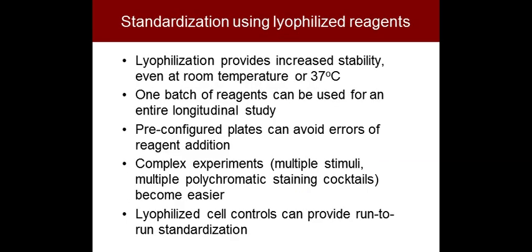Let's go on to the point about standardization, which goes kind of hand in hand with controls. I think when you're designing your multicolor panels, you want to think about the long term. You want a panel to be reproducible over time. And the main point that I want to make here is that there are multiple ways to achieve this, but one which you might not have thought of, and therefore I threw in this slide, is to use lyophilized reagents.